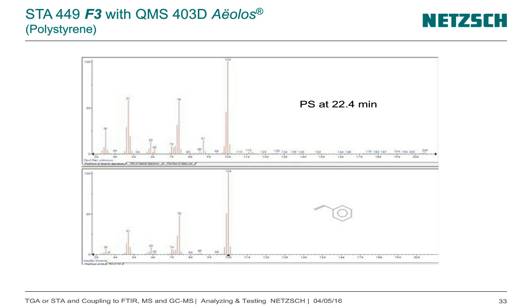So this is a problem with the mass spectrometer. If you have several substances, it's sometimes hard to identify which substances are inside. If I would use only the mass spectrometer, how could I be totally sure that the 91 is toluene and nothing else? But for the main products, it works in a lot of cases.